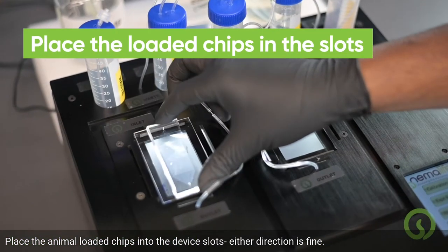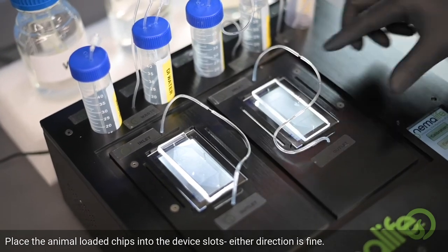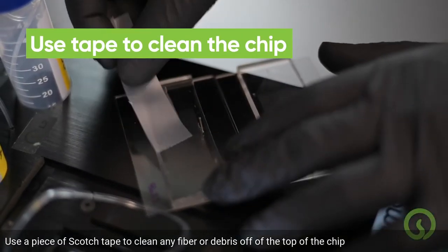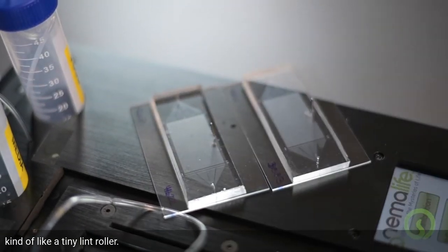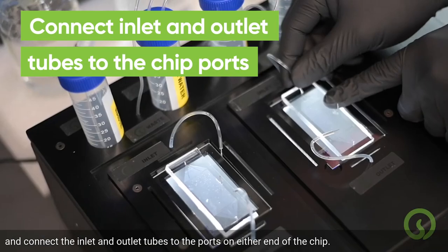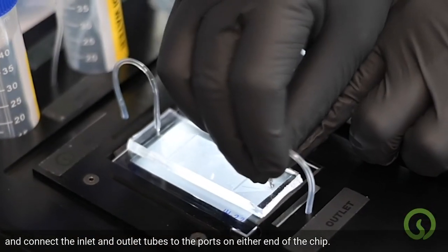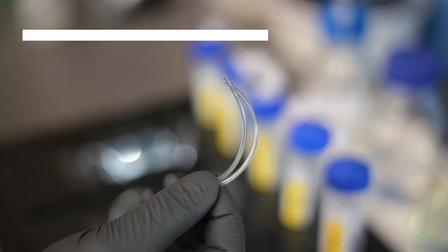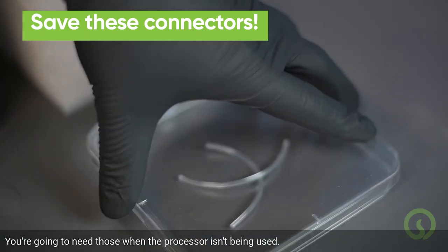Place the animal-loaded chips into the device slots — either direction is fine. Use a piece of scotch tape to clean any fiber or debris off the top of the chip, kind of like a tiny lint roller. Disconnect the connector tube and connect the inlet and outlet tubes to the ports on either end of the chip. Be sure to keep the connector tubes in a safe spot, as you'll need them when the processor isn't being used.